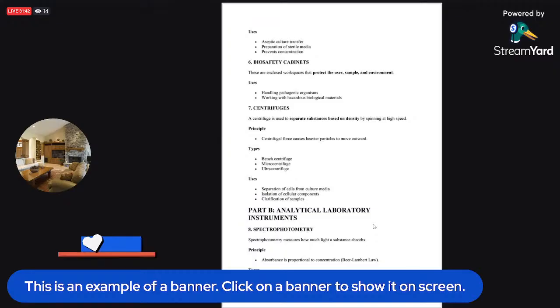And the way it is even constructed, you come across a lot of partitions. When you are coming in, you have to change dress in laboratory way, and so on and so forth.